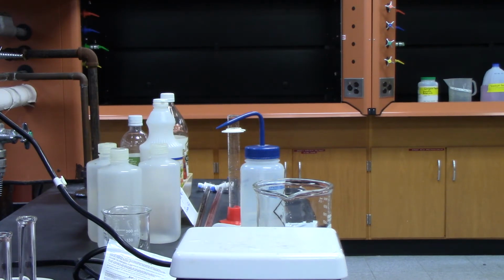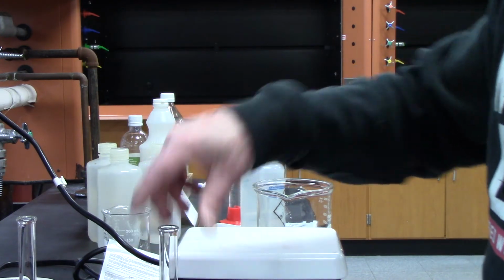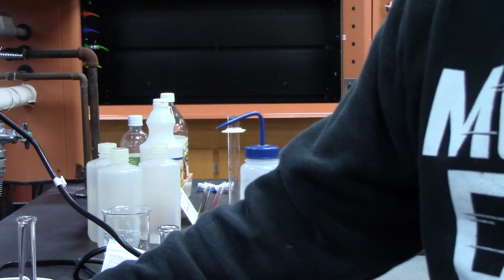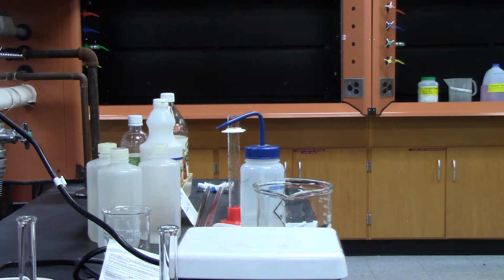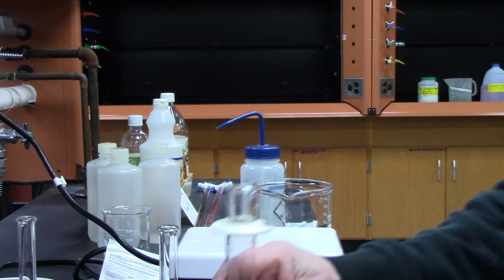Okay, so I'm now going to make my 55 times 10 to the minus 4th using, well, I'm going to make 10 to the minus 4th using number 1. So that's going to be this guy. I'm going to take 50 mils of number 1, and then 50 mils of water. This time I'm going to use a graduated cylinder to measure out the 50 mils.